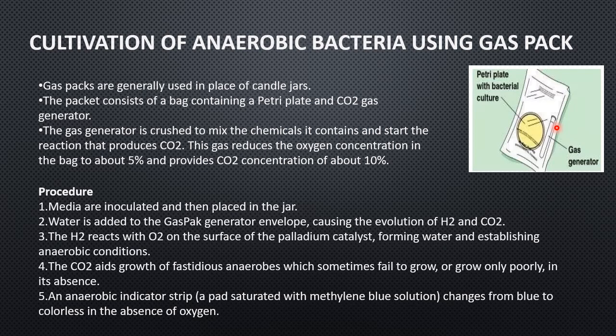So you can say comparatively the carbon dioxide environment is more in your gas pack. That is the reason we use the gas generator while working with anaerobic bacterial cultures: to generate a higher CO2 concentration, and you have to remove the oxygen.